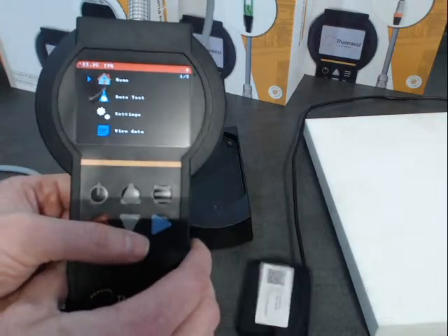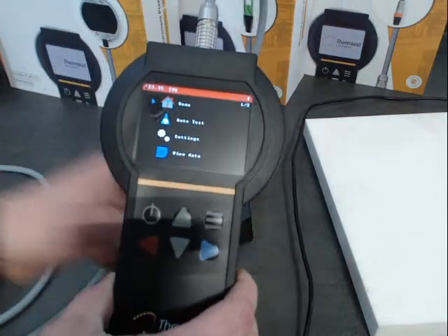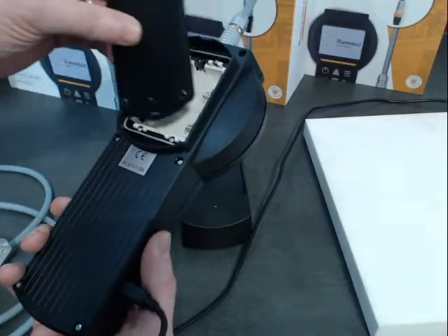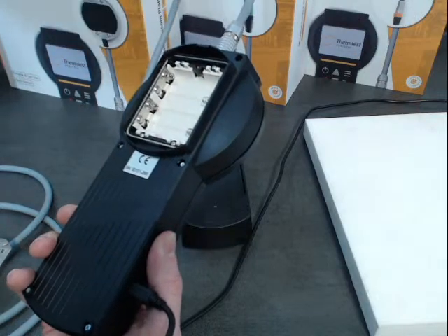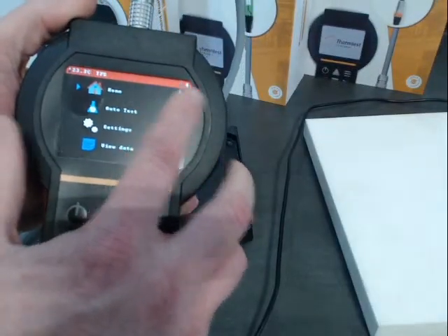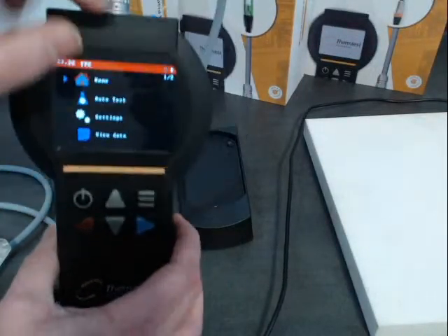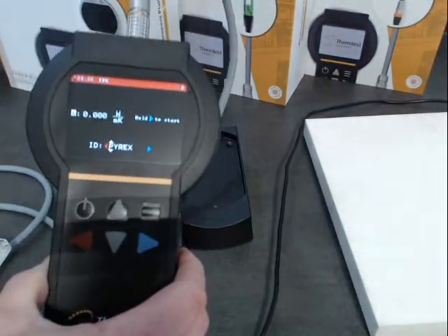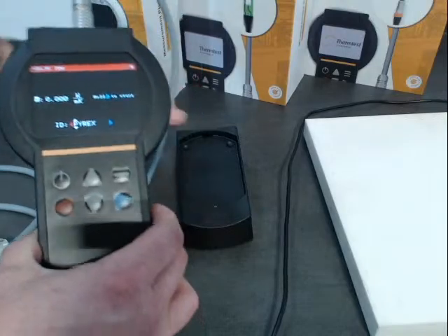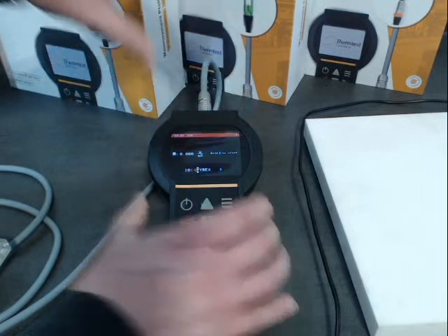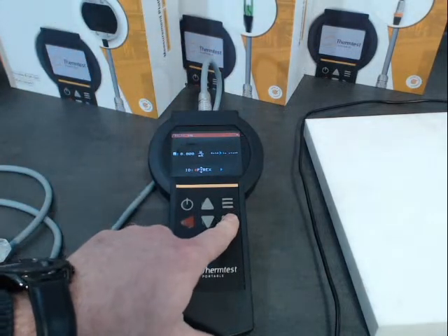I'm going to go back to the home. This can run off batteries — there are no batteries in it right now because it is connected to the computer since I'm going to download the data. This can be powered from the wall, batteries, or either. There's a little light that tells you it's on. It comes with a little cradle that keeps it sloped for easy viewing. I'm going to click the blue button to engage the measurement.